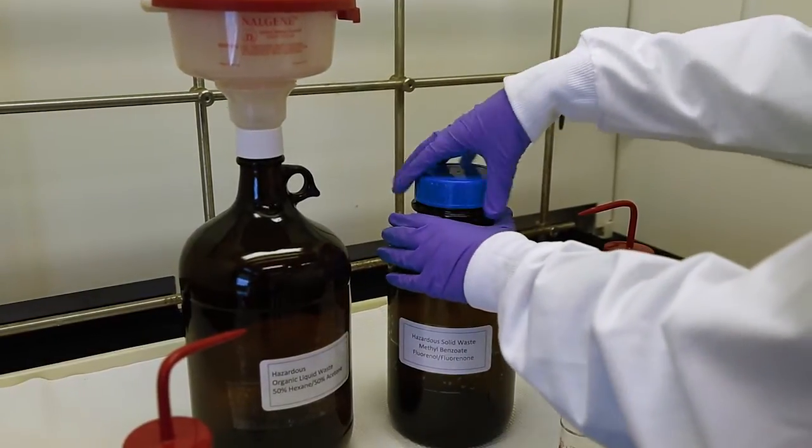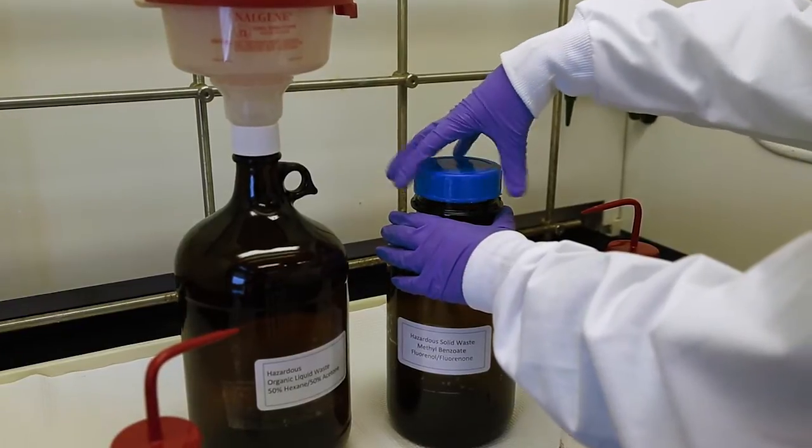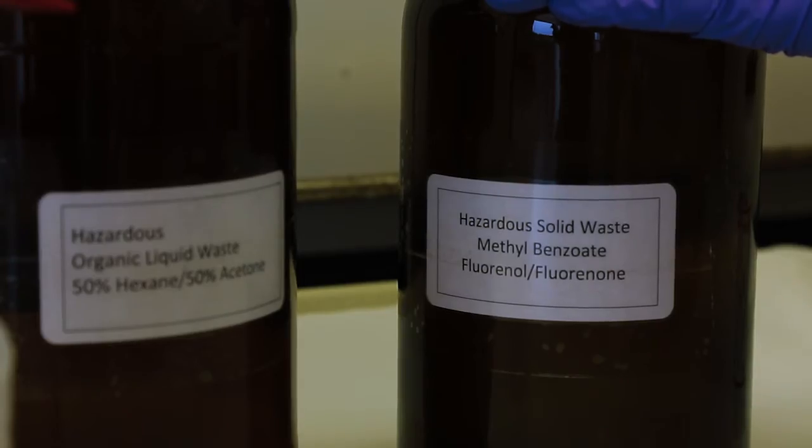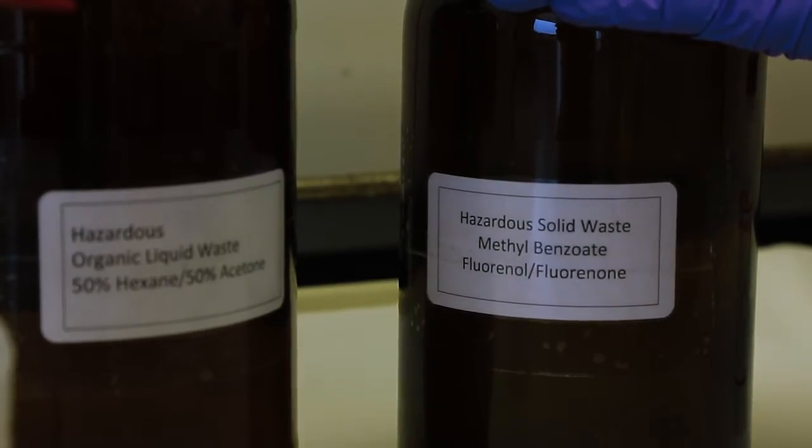Solid waste does not go in the trash. Place all solid waste from the experiment into the container labeled for solid waste in the fume hood.